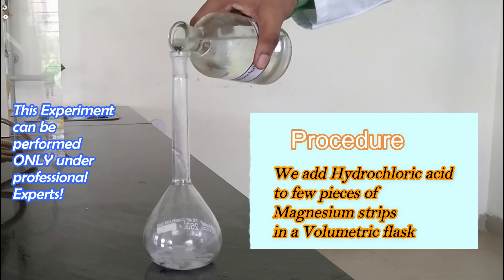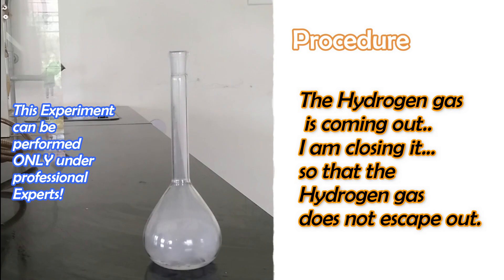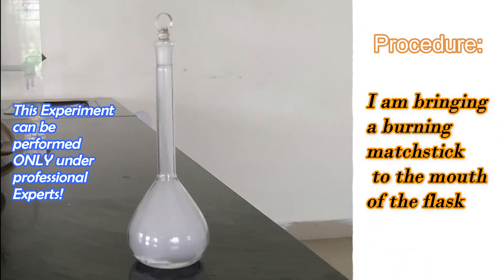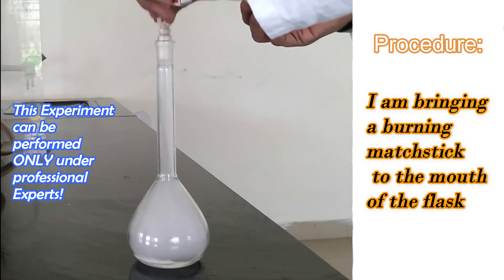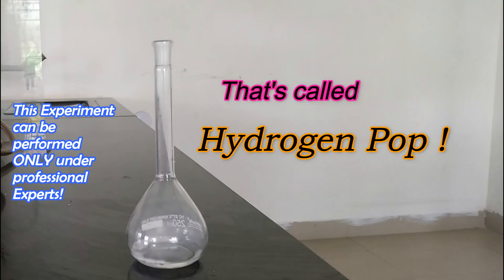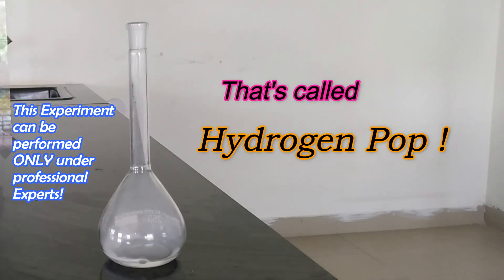The hydrogen gas is coming out. I am closing it. I am bringing a burning splint to the mouth of the flask. That's called hydrogen pop.